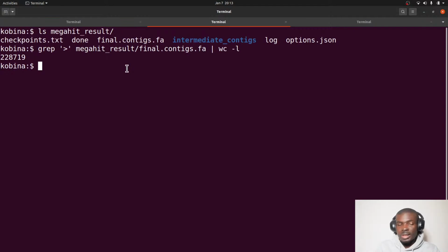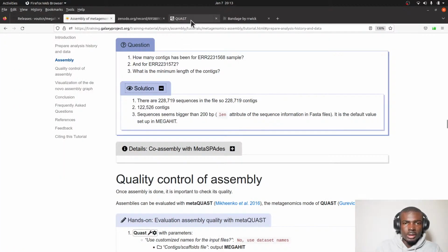To evaluate the assemblies, you can use tools like MetaQUAST, and to visualize, you can use tools like Bandage. The evaluation is a QC to let you know the quality of the assemblies, and then visualization will also help you to know if you even have complete bacterial sequences or not, and also identify occurrences such as long repeats, etc. But I'm going to cover the evaluation and the visualization in another tutorial, so just make sure to come back later to watch that. So let's check the tools that can be used for the evaluation.